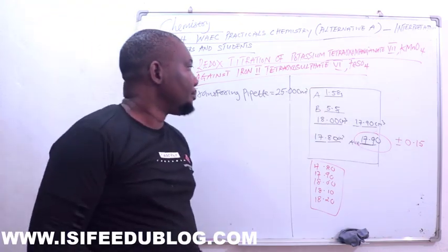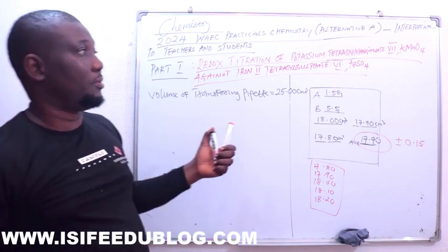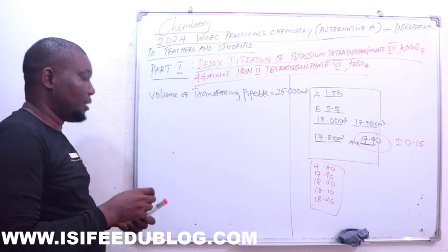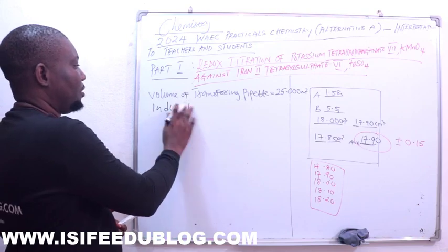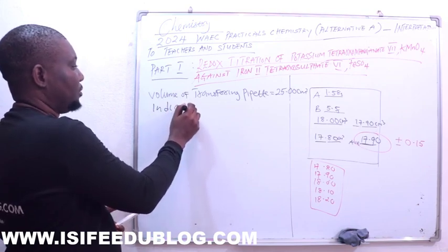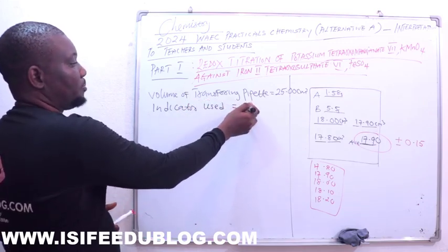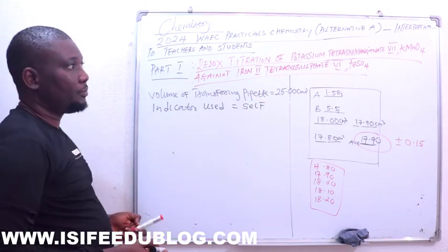Okay, so in this titration, like a redox titration, no particular indicator is used, but I think I'll explain it later. Let me write it as self-indicating.